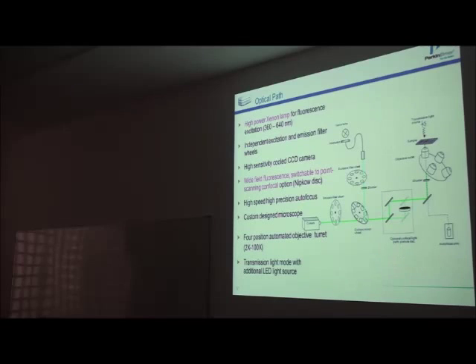But what we have here is another system for autofocus. This will just find the sample automatically. Because it's an automated system, you don't have to move anything. This is the autofocus system, which will just find the sample for you. You can put up to four different objectives at the same time in the machine, and you can choose them from 2x to 100x. Next to that, the transmission light is another light source, which is just here for bright field illumination, for people who are interested in cell morphology without any staining, right?